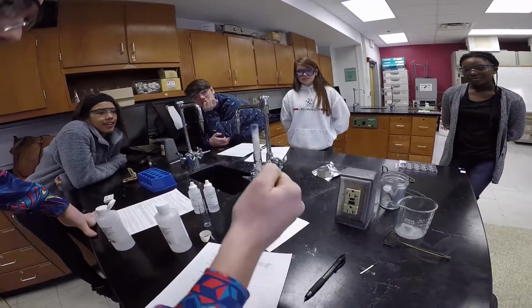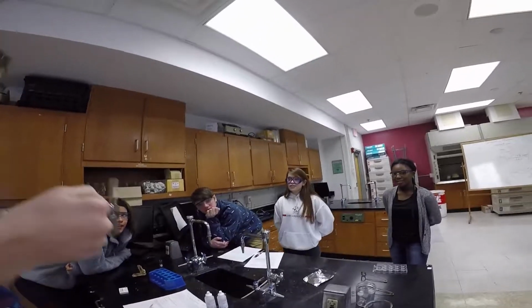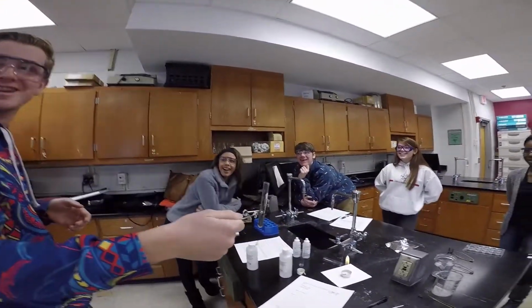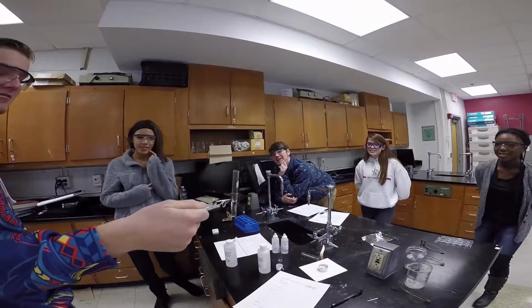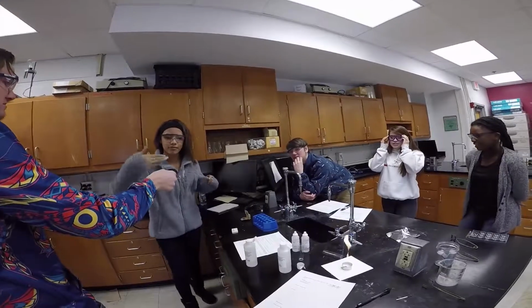That's good. You're rolling over there. Be careful though. It could shoot out of that test tube. What's it smell like? Deadly. That hurt. I don't want to smell it. Like pineapple. That burnt my nose. What does it smell like? I don't know. Like vinegar. Vinegar? Okay. So what color is it?